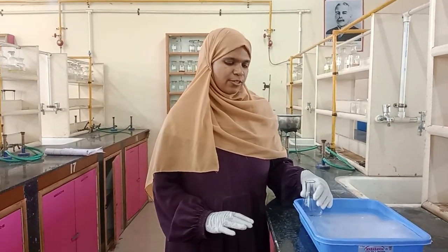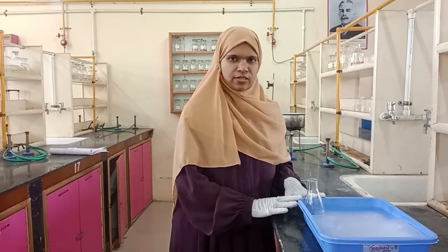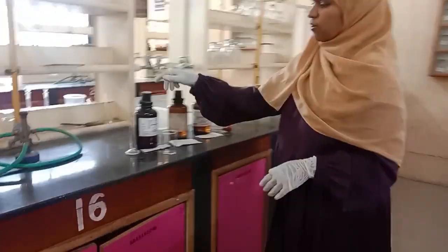Now we add 1 ml of acetophenone to this solution. We take 1 ml of acetophenone.